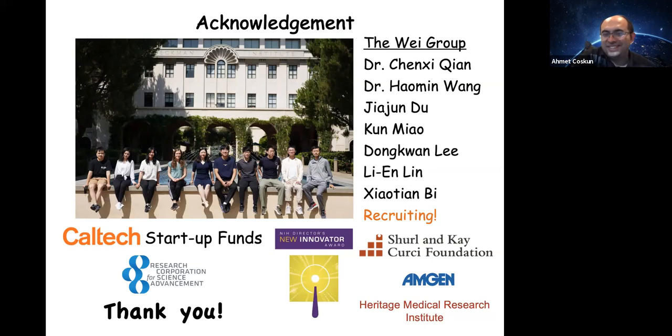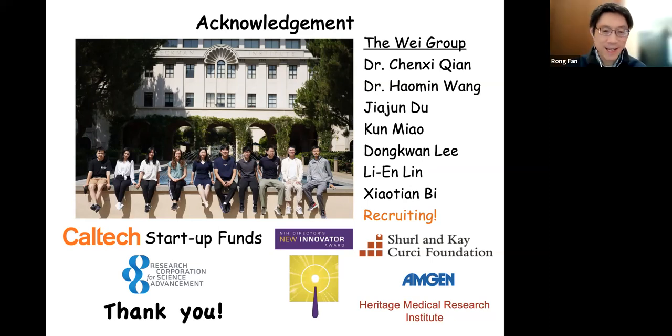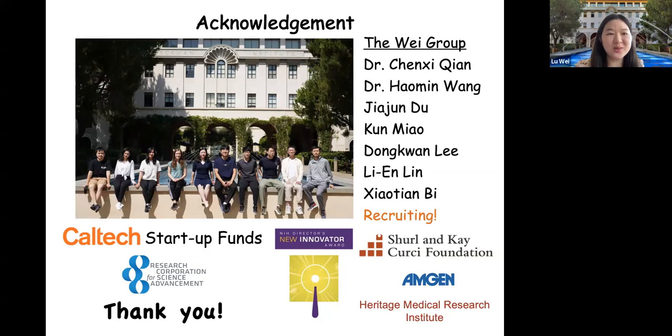Mm-hmm. Yeah, that would be pretty cool. So if you can combine label-free and labeled imaging of the target proteins or transcripts, maybe you need to do this sequentially. For example, do label-free Raman imaging, and on the same tissue apply 12 different Raman dye-labeled antibodies so that you can do protein imaging. Definitely, that's a good thought. Hopefully I would be very interested to collaborate with you on your single-cell transcriptomics technology to fully explore that.